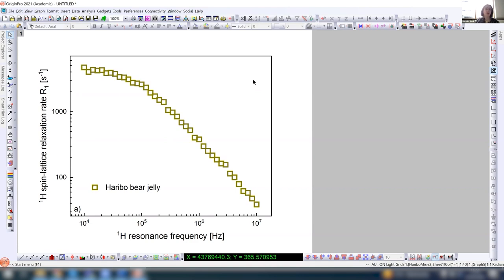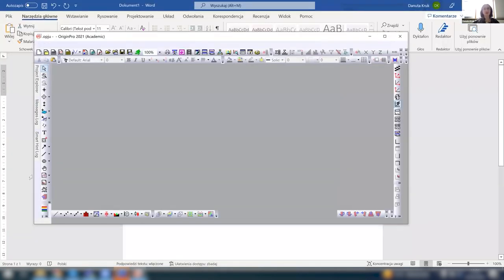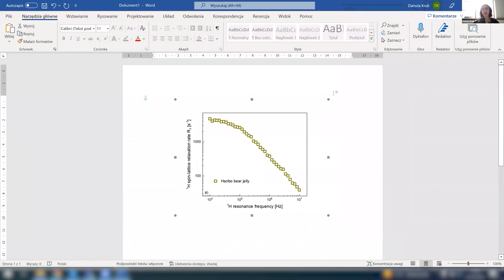However, on the other hand, we really do not know what we are looking at, and we really do not know how to start the analysis. One can do, in such a case, a very simple thing. I don't know whether it will work. I did not try it before, I have to confess. I tried some other things before. However, anyway, let me put it like that. I have completely unknown data.